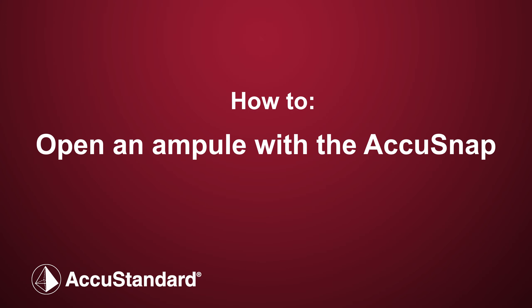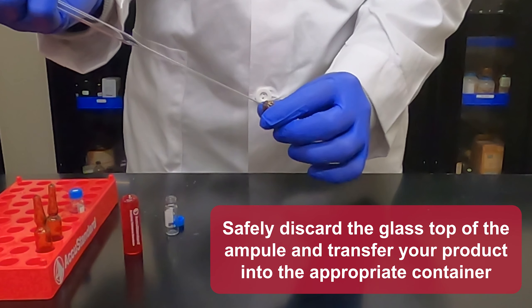Slide the AccuSnap down to the score line on the neck and gently pull the AccuSnap. Safely discard the glass top of the ampule and transfer your product into the appropriate container.